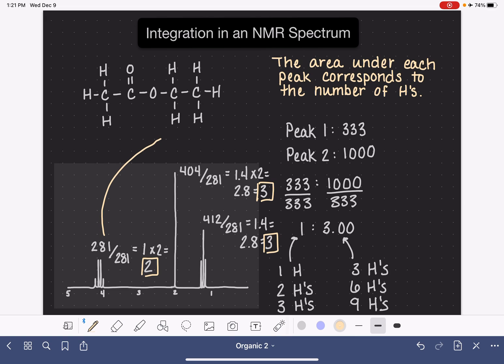We've already spent quite a bit of time analyzing this spectrum, so we already know we've determined that this peak that is around 4, that is associated with the CH2. So an integral of 2 is perfect. And this peak right here, which is around 2, that's associated with the CH3 group. So that integral is perfect as well. And then our peak that's around 1, that is associated with this CH3 group. So that worked out to be perfect as well.